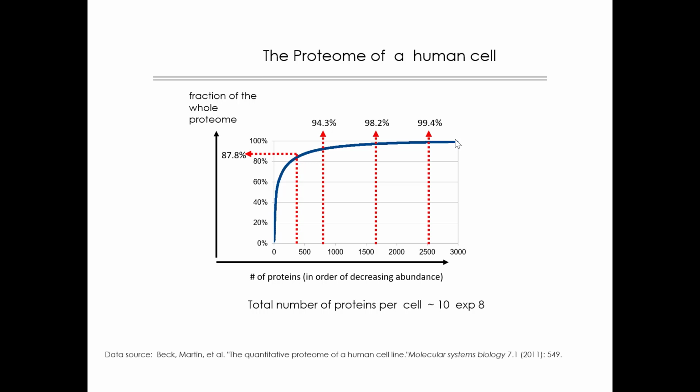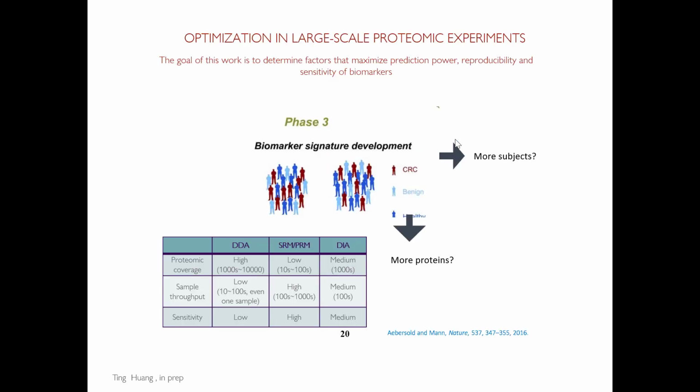Virtually every protein modification, every perturbation also shows up in high-level proteins. So that's the justification why we think that these DIA methods are highly relevant for measuring the response of cells or tissues or humans to certain perturbations, even though they do not see the whole proteome.